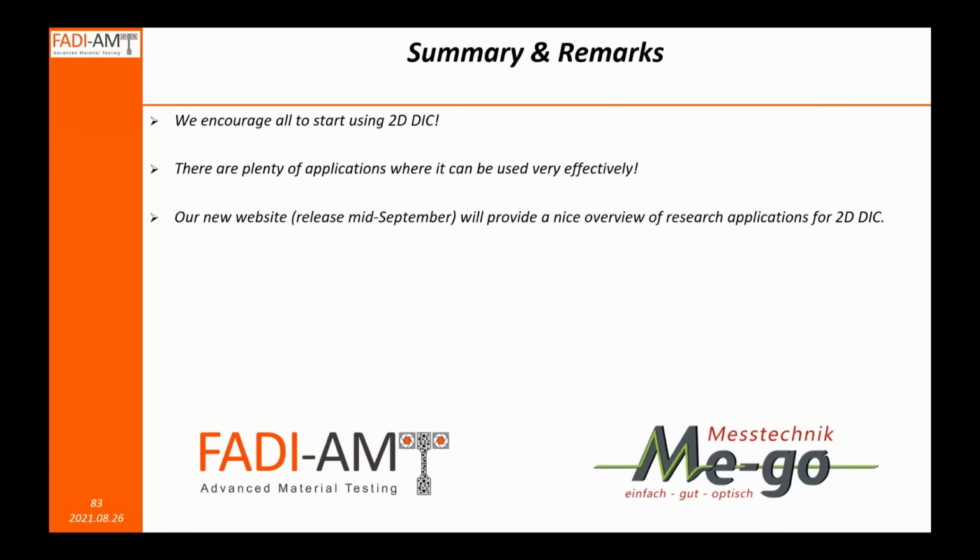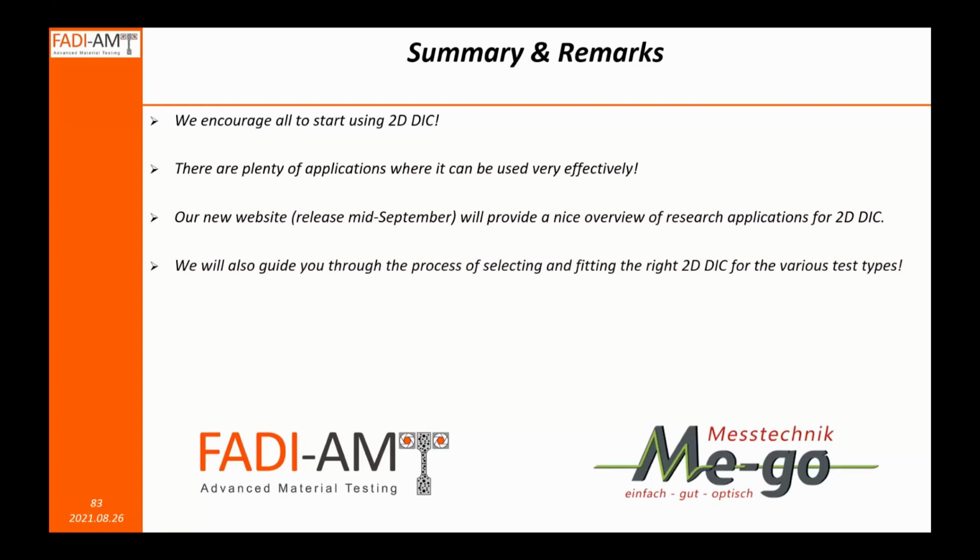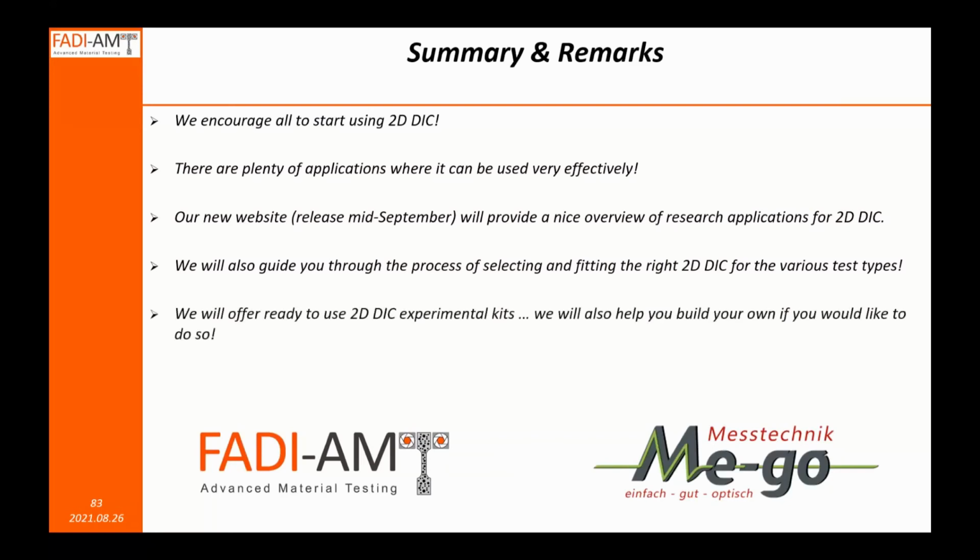We're going to talk about more complex tests than these: shear testing, fracture testing, but also compression testing, cyclic testing, and plane strain testing, those localized tests that can also be done with 2D DIC. We will even provide guidelines for how to set up, what the parameters are, how to select them for a particular application, and how to select the proper 2D DIC system.